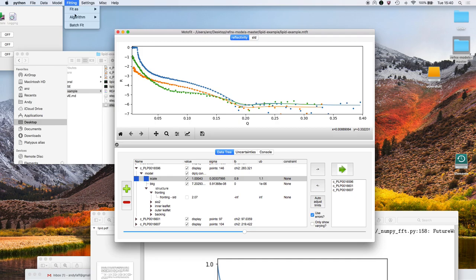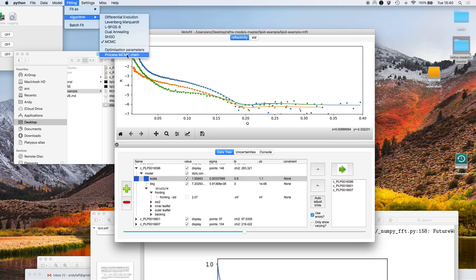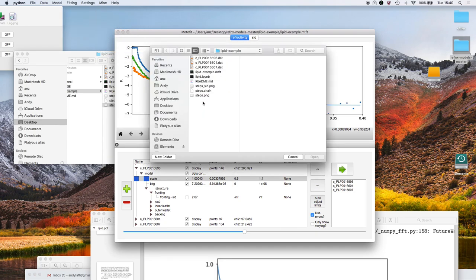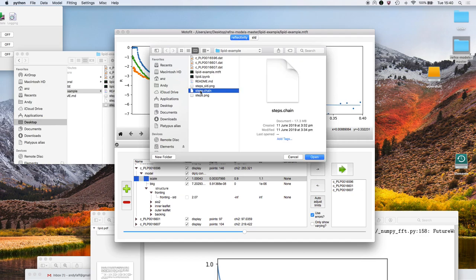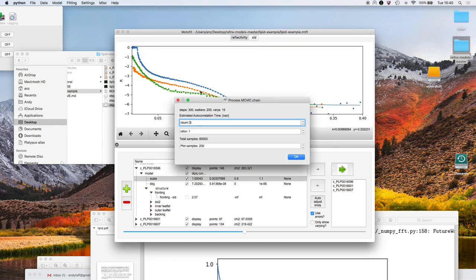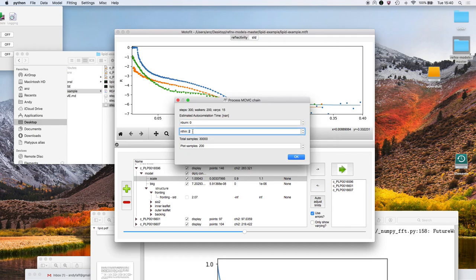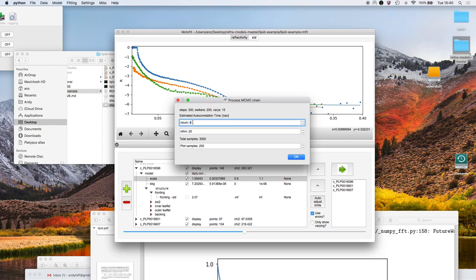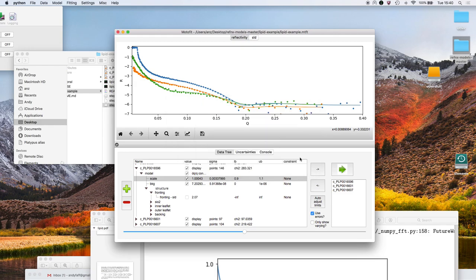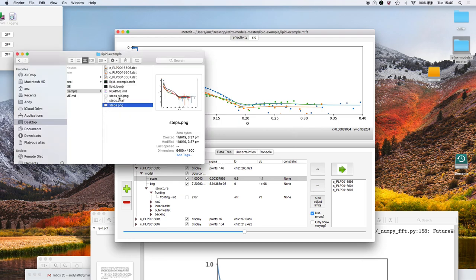Lastly I should say that we can process the chain afterwards. So after you've done the sampling you can revisit the analysis, select the chain file, and then we can experiment with changing the thinning parameter or changing the burn parameter and so on. In that case you can experiment with what effect they have on steps_sld and steps.png.